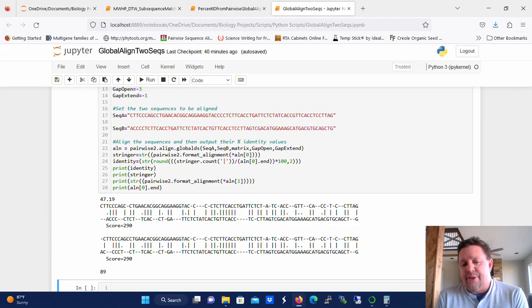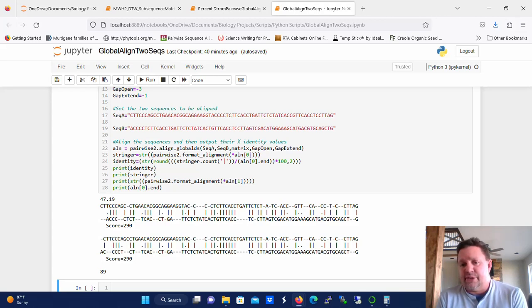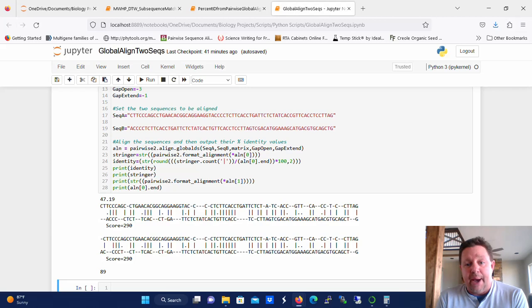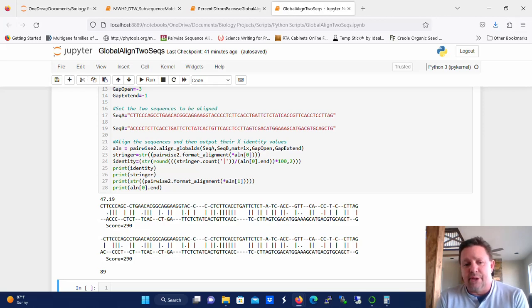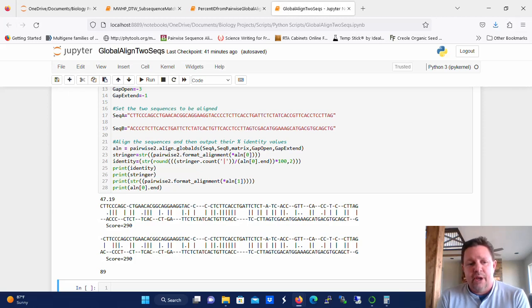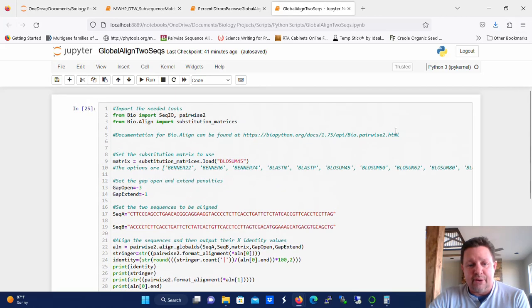That's not what we're dealing with today. What we're dealing with today is a less common situation where you absolutely know that two sequences correspond to each other, but you want to calculate their percent identity across the entire stretch of the sequence. So this is called a global alignment. And I'm going to show you how to do it with the bio.align package in Biopython. I'm just going to show you a real simple way of doing it. In practicality, you would normally do this to develop an identity matrix for multiple sequences. I'll show you just real quickly one of those identity matrices that I formed using a very similar script to this one. But anyway, let's walk through this code and go over what you need to know about this code.